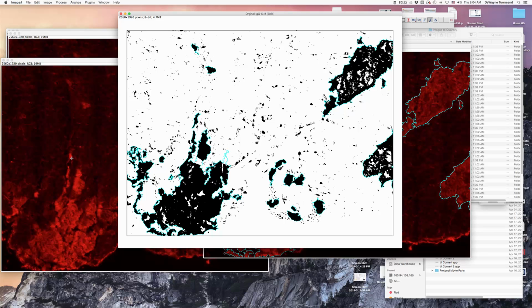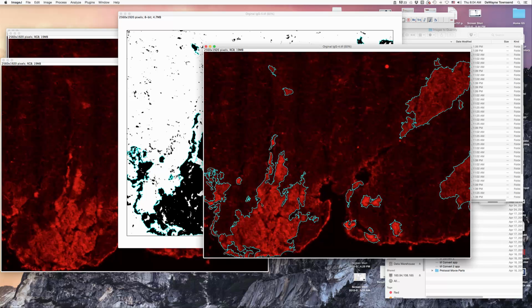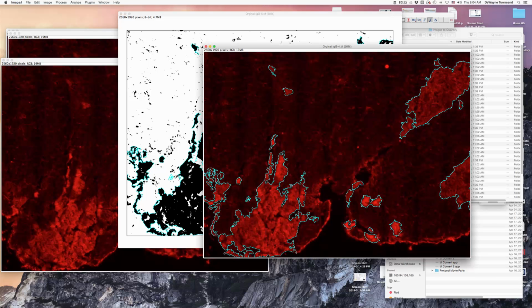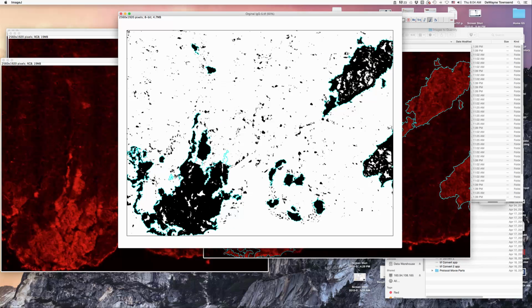So I think we'll keep this stuff heading up that way because that all seems to be appropriately positive. There's this little area of noise out here, which is clearly not on my side. Just a little contiguous thing. We can get rid of that. We kind of move along here looking at the different things. This little shoulder here is probably not positive. Get rid of that.